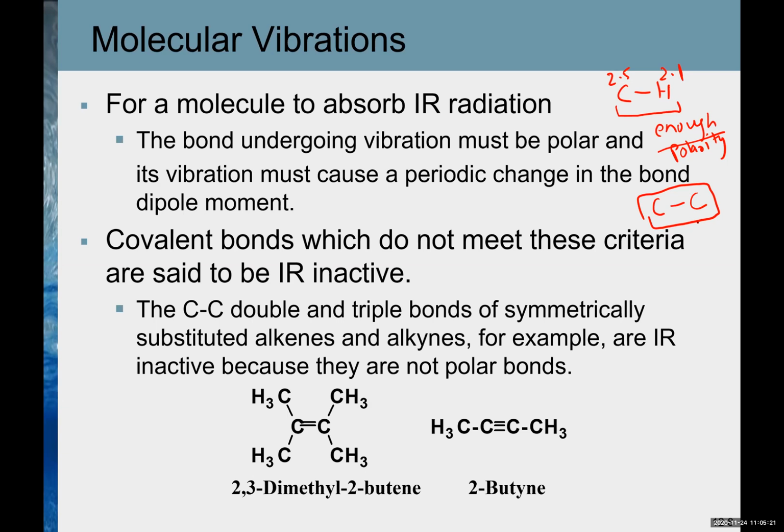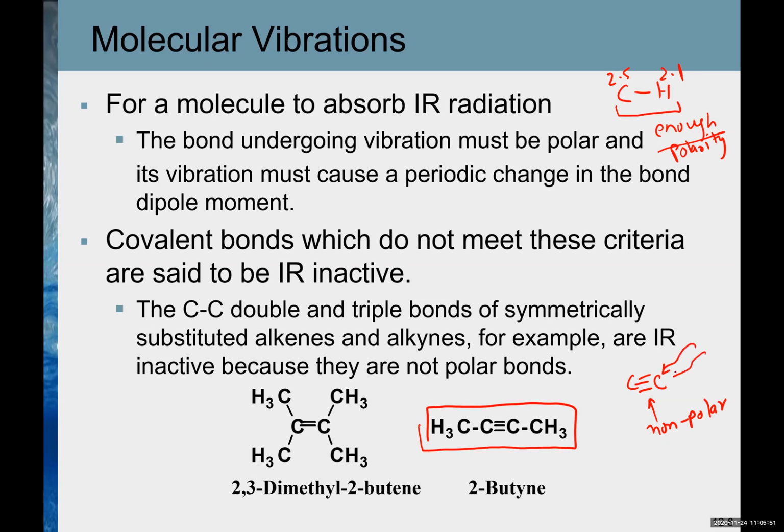I'll give you another example. If we have a molecule like this one, a symmetrical triple bond, C triple bond C, that's non-polar, right? So what do you think? Will it be able to absorb the infrared radiation?